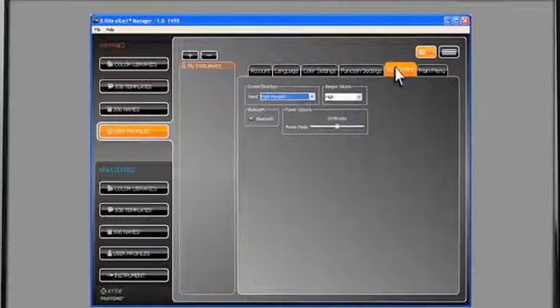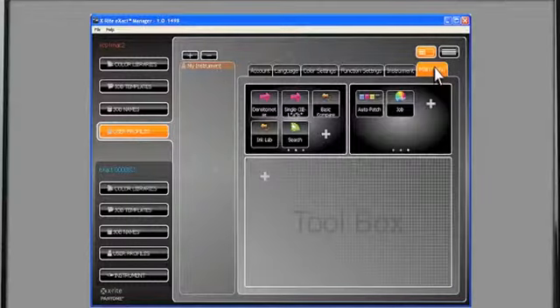In the Instrument tab, you can set specific settings for instrument handling. This includes the screen direction, depending if you're right or left-handed, the beeper volume, the ability to turn Bluetooth on or off, and your power options. Finally, the Main Menu tab. This allows you to define the layout of the 2 configurable main menu screens.